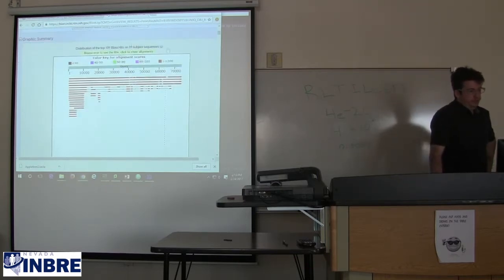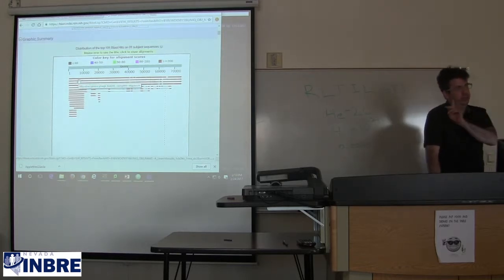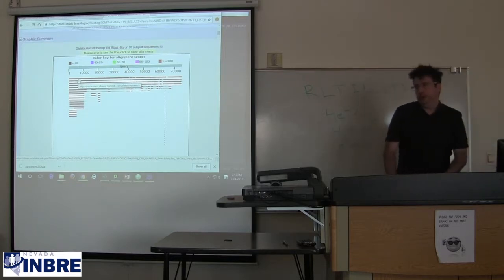So at the graphic summary, on the top line we have an unbroken string of Apple Tree 2 matching Apple Tree 2, and that's expected because Apple Tree 2 was found here, and it's not there at NCBI.